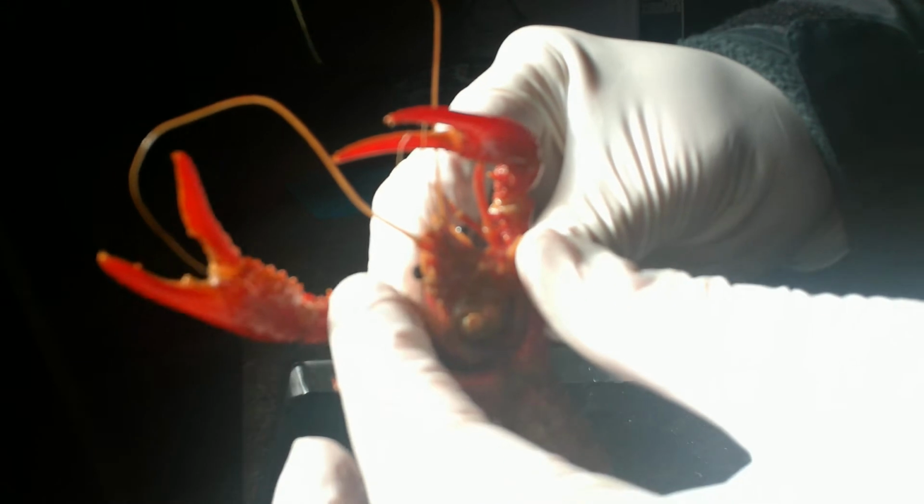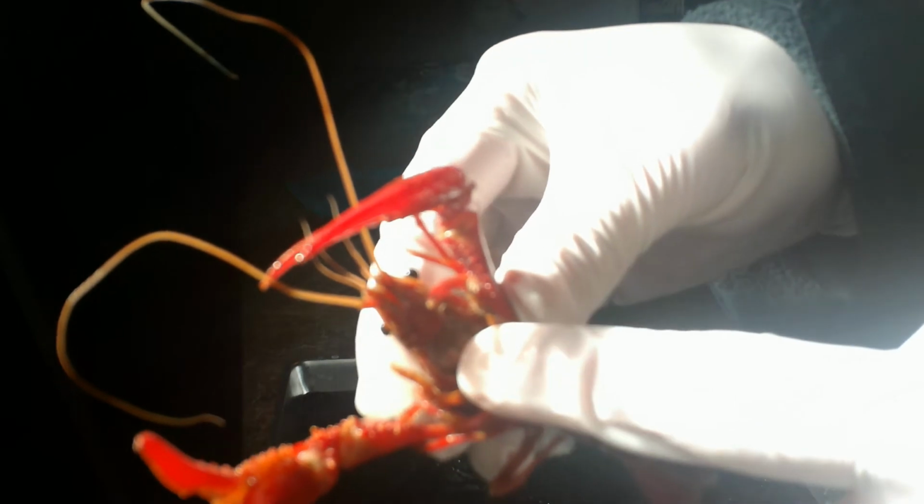Of course, we have our really big chelipeds here, okay? Kind of like how you would see on a scorpion. So we have these guys here. And then down below these guys here, we have our mandibles, right? So crawdads fall under mandibulata, okay? And then the mouth is actually all the way down below in between the mandibles down here, okay?